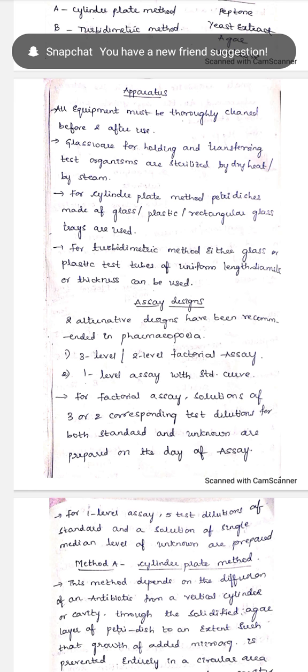Here you also have some assay designs. Two alternative designs have been recommended in the Pharmacopoeia: one is the 3-level or 2-level factorial assay, or the 1-level assay with standard curve. So here we are using two types of method: one is the cylinder plate method, another one is the tube assay method. As you know, this method depends upon the diffusion of an antibiotic from a vertical cylinder or cavity through the solidified agar. Just now we discussed that you place some antibiotic on a solid medium, and slowly the zone of inhibition is checked.